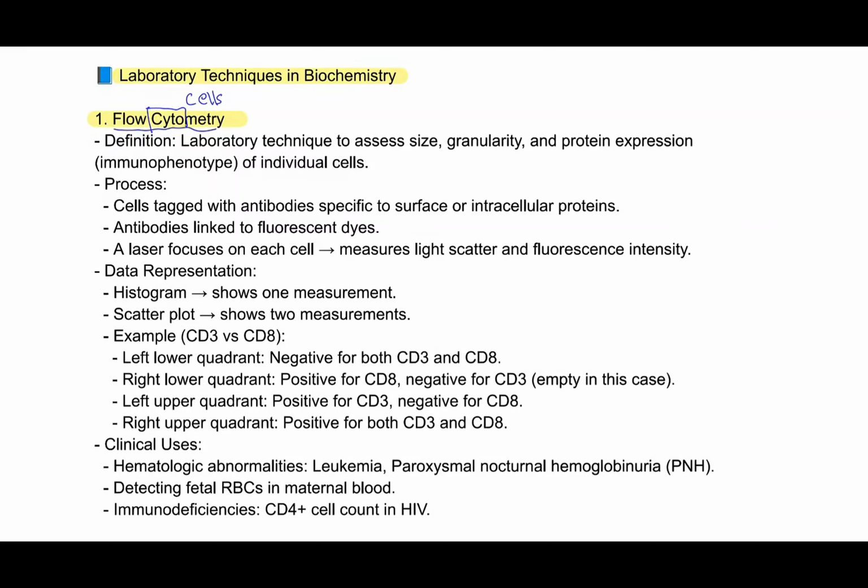and we assess size, granularity and protein expression of individual cells. Definition of flow cytometry: laboratory technique to assess size, granularity and protein expression of individual cells. It is also known as immunophenotyping.